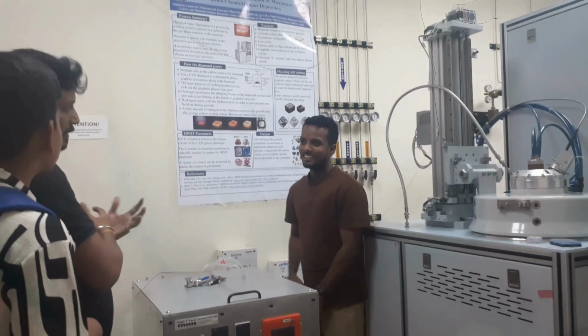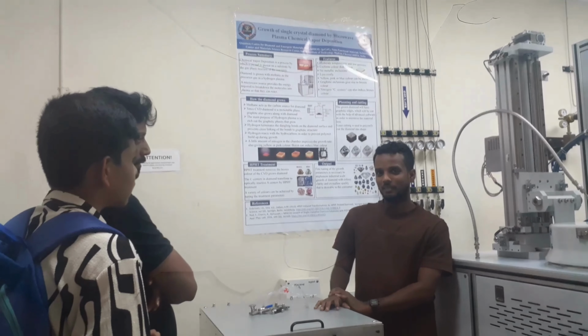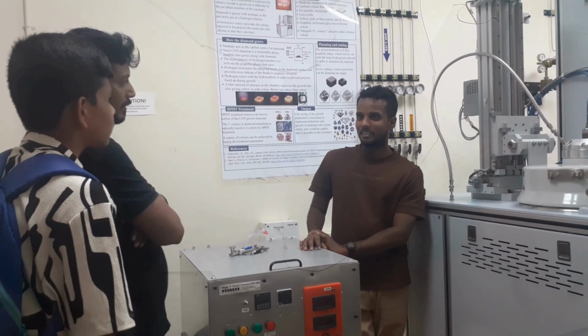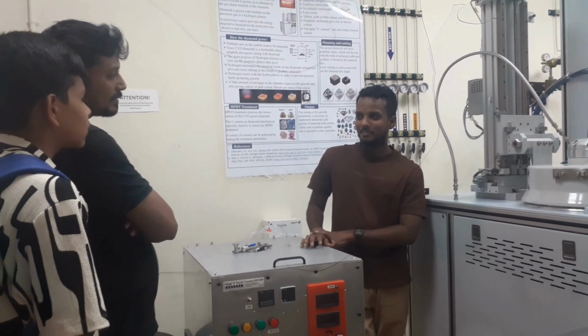Are you tied up with the Tata group or something? No, we are working independently. It is a government project. Are you selling the diamonds? We are not selling. We are working in research only. Our ultimate output will be the result, not the quantity of diamonds. So we are working on applications.